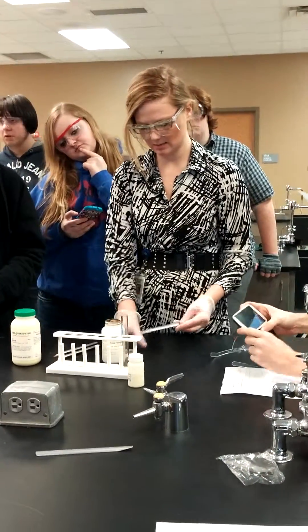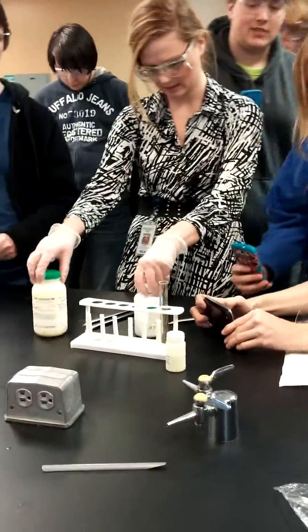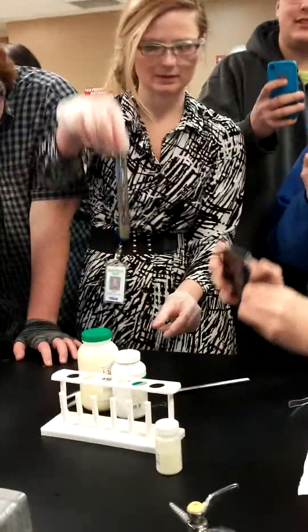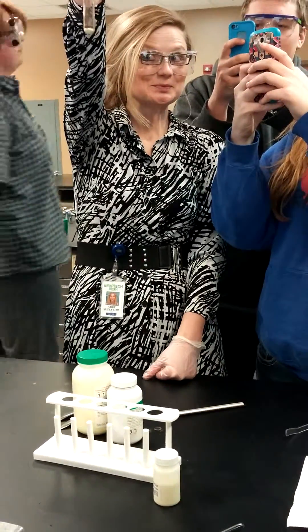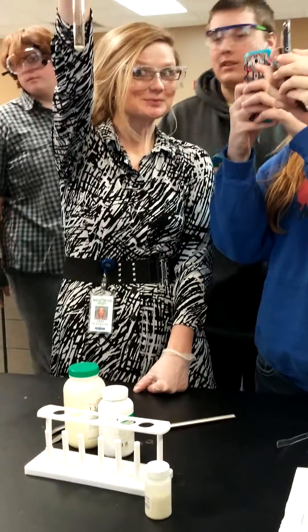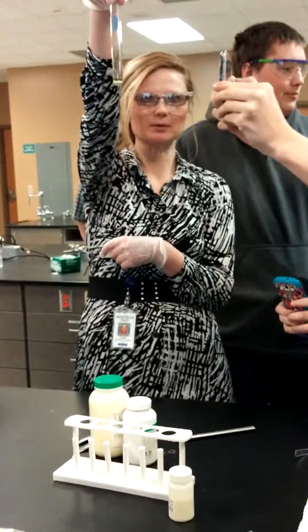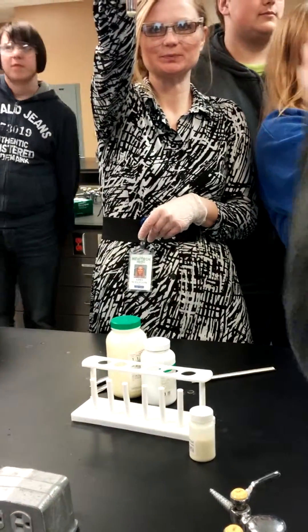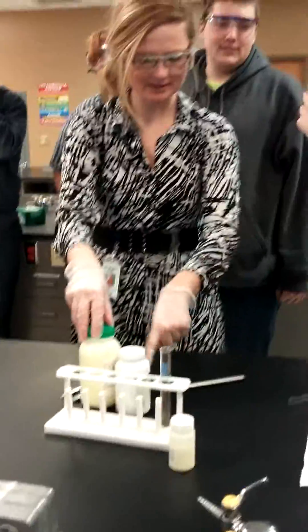So let me put... If you would like to, you can take a picture of that. Just hold it up in the air so everybody can see. You're gonna figure it out. Okay, here's the sulfur and the iron.